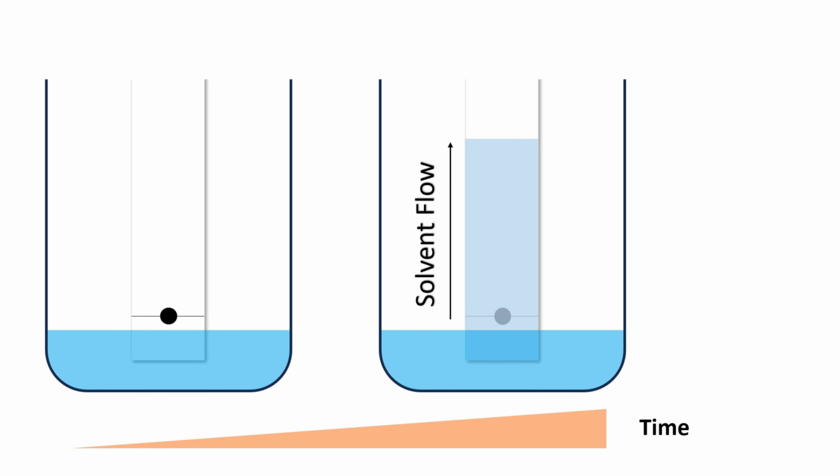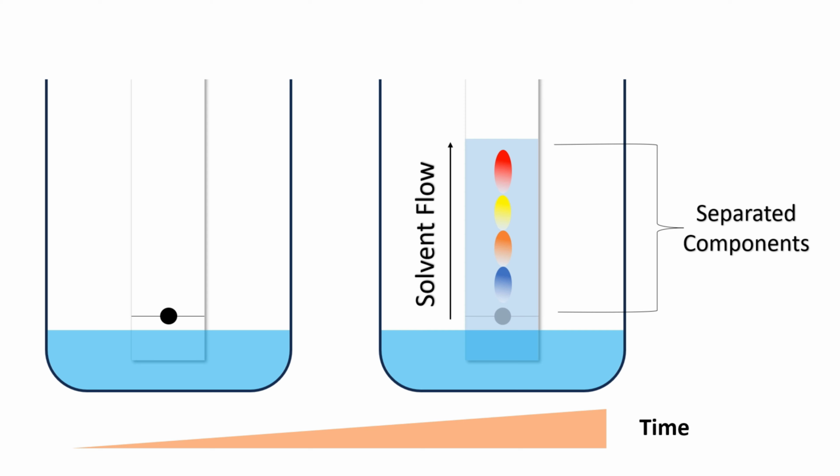It just got separated into its components, and every color reaches a specific height. The more soluble color will reach the furthest height, and the color which is less soluble will just remain near the bottom of the filter paper. So in this way, we use this technique to perform different experiments.